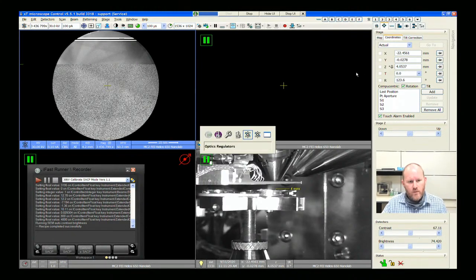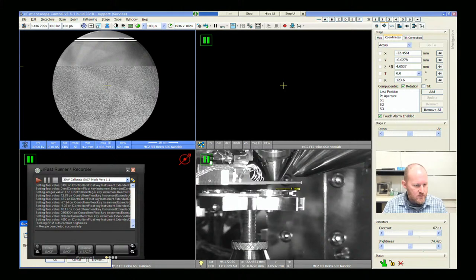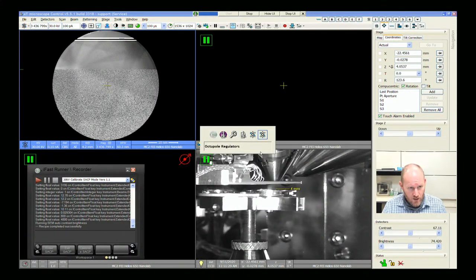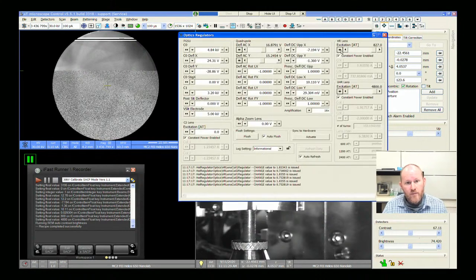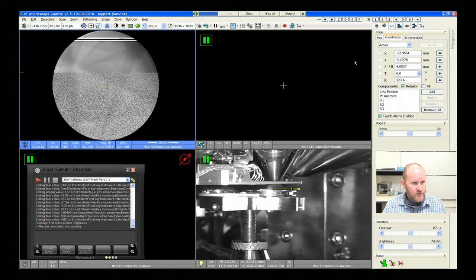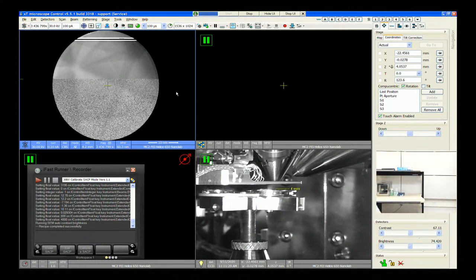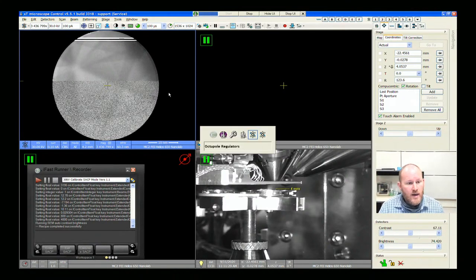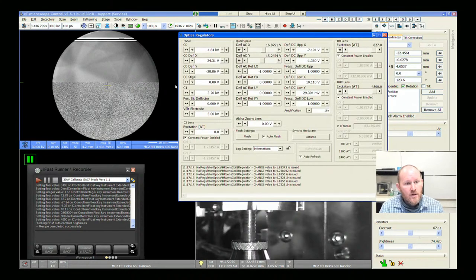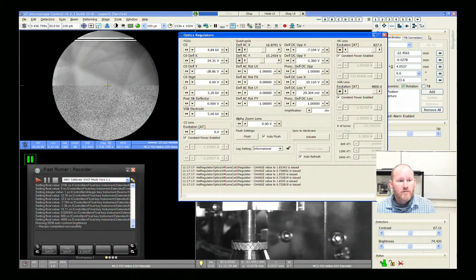What I wanted to do here was make a note of the values. 827 amp-turns is what we found on the HR lens, so I'm going to make a quick note of that in my notebook. And 16.8 is the deflection for X and 15.2 is deflection for Y.